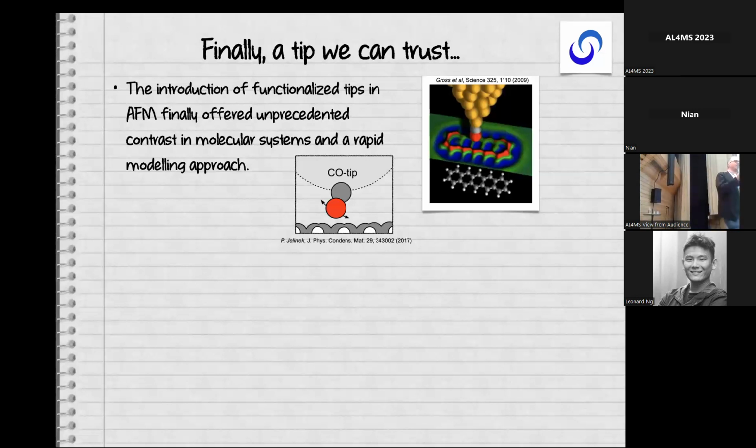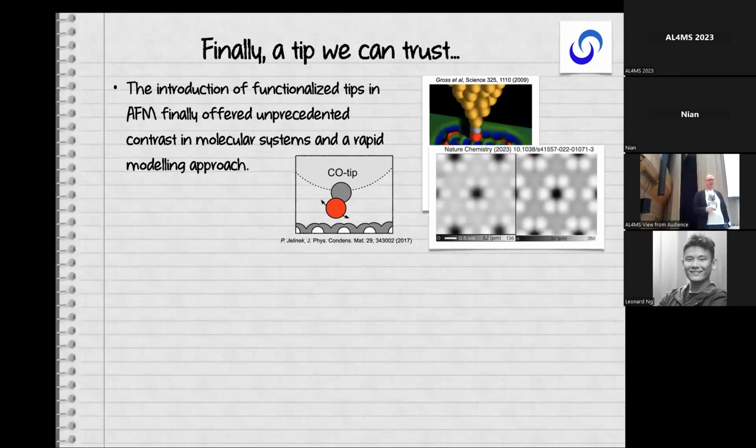So you see where the atoms are. In principle, you see where the bonds are in the material. And this was soon partnered by simulation tools, which were very good, that we could get really good agreement between experiment and simulation at very minimal computational cost. And of course, it's my talk, so I can pick one example from our research.